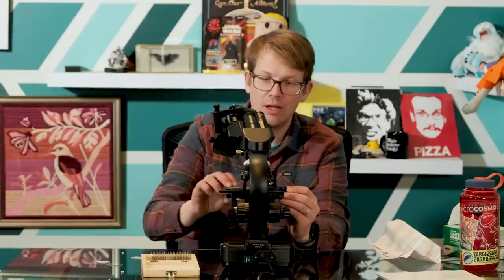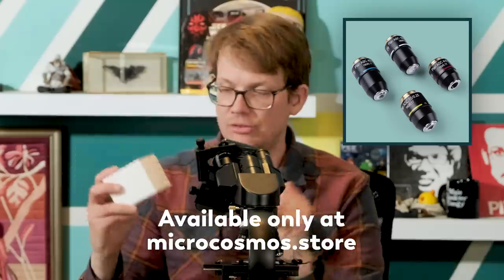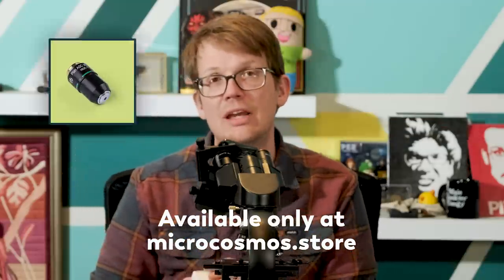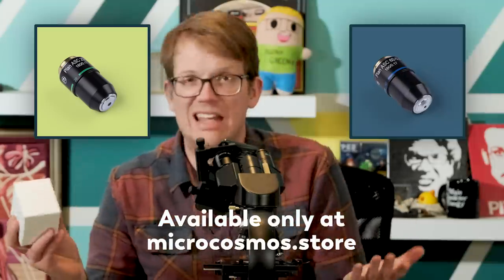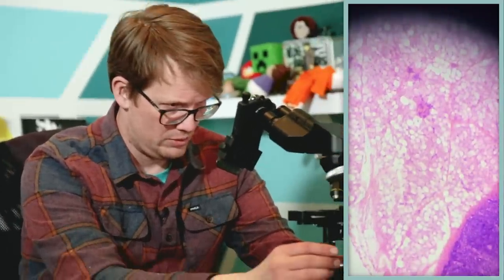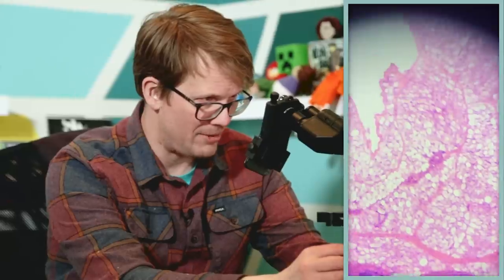We also have plan objectives available — slightly higher quality lenses — which you can get as a set of all four to replace the ones you have if you have the base model and want to upgrade. We also have the 20X and the 60X available separately if you just want one or both on their own. I've just put in a lymph node. Oh yeah, hello. I know nothing about histology — this is not my area of expertise.